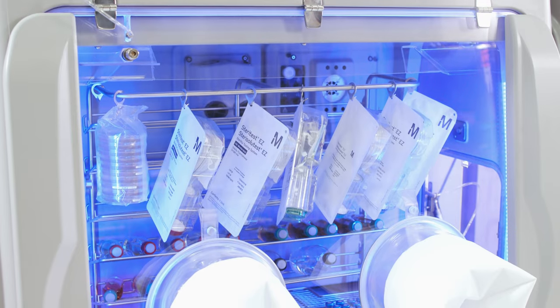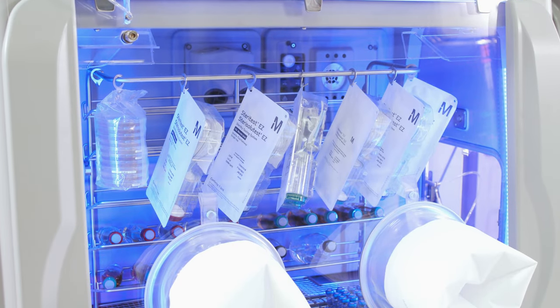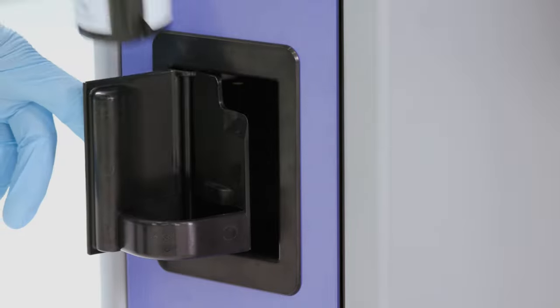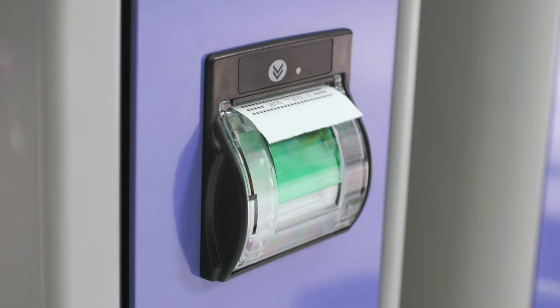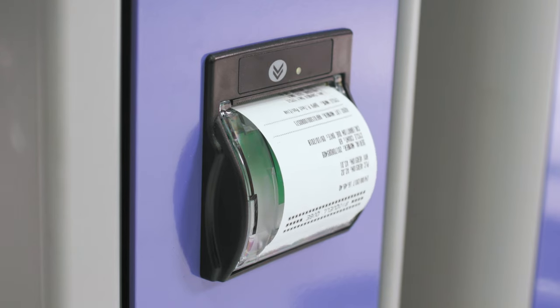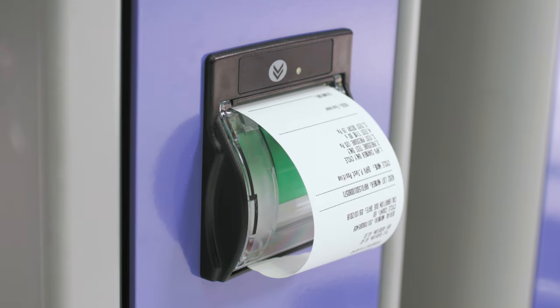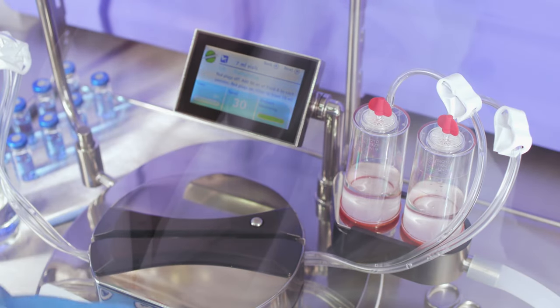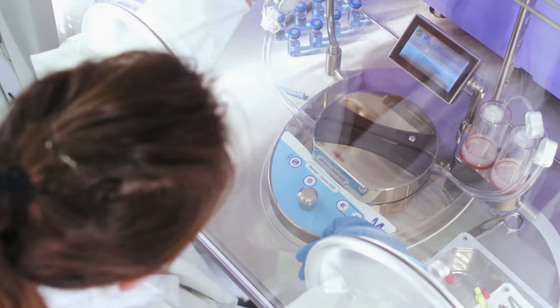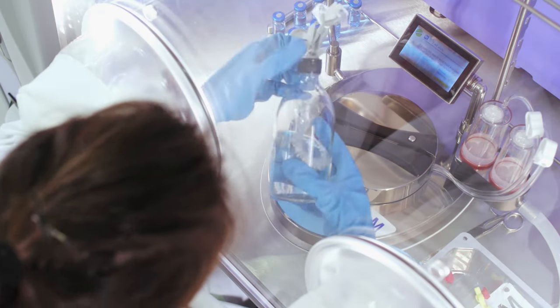At all times, you have full traceability and quality control through RFID tags on hydrogen peroxide bottles, environmental monitoring and integrated cycle reports providing detailed cycle parameters. Optional capacity for 21 CFR Part 11 compliant logging software is available as well.